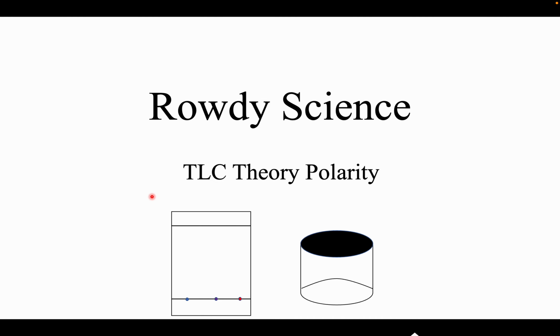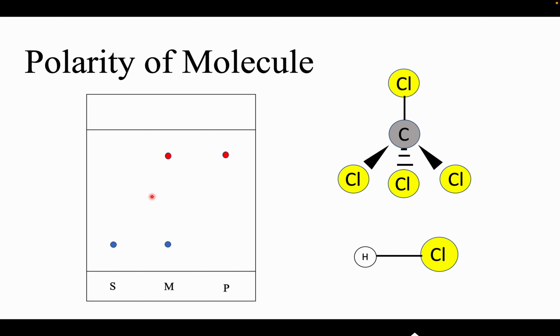Today I'm talking about thin layer chromatography and how polarity relates to it. Let's get into it. Polarity plays an important role while interpreting your TLC results. Before I explain how it directly relates, let me give you a basic idea of what polarity is.